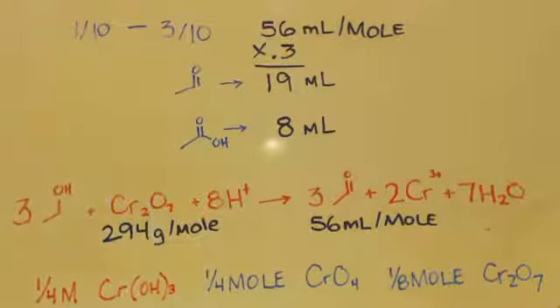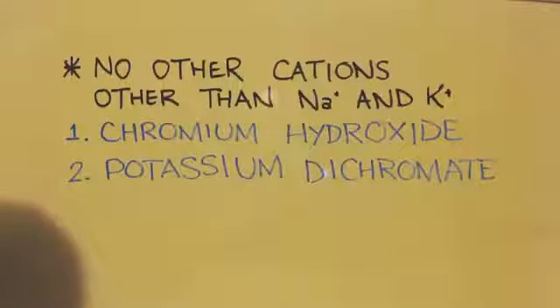But as you can see in the formula also, I wanted you to notice, there's no other cations, no other metal cations. There's only chromium. As long as you only introduce sodium bicarbonate and like sodium sulfite, all sodium cations, you have no problem with this recycling method. I hope somebody learned something from these videos about chromium chemistry, and the cycle and the ligands.